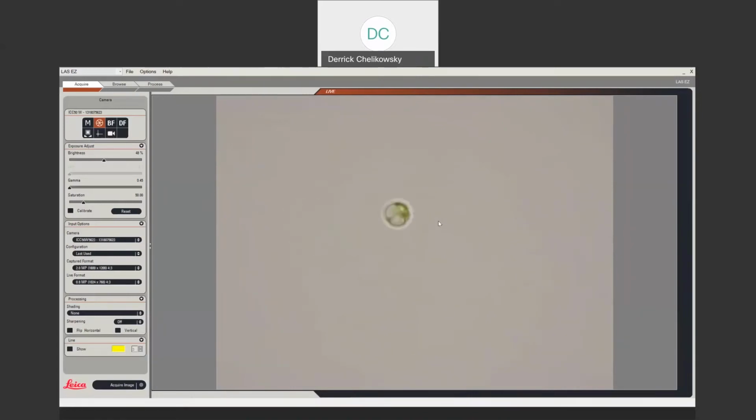And it is a dead cell. Let's see if we can... Yeah, we don't see the remnants of a flagella on this one. I mean, that might be a little bit of remnant of a flagella, but that is most certainly a dead cell. Oh, there's another dead one.